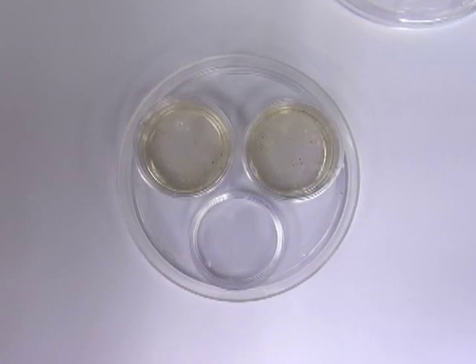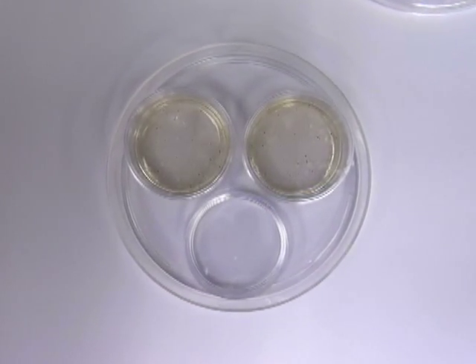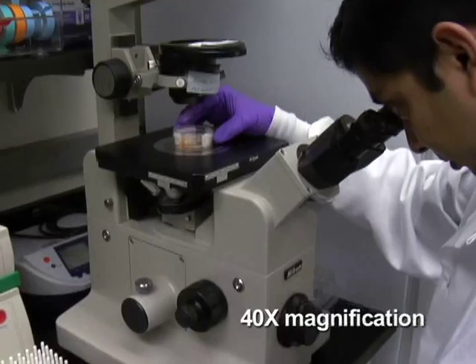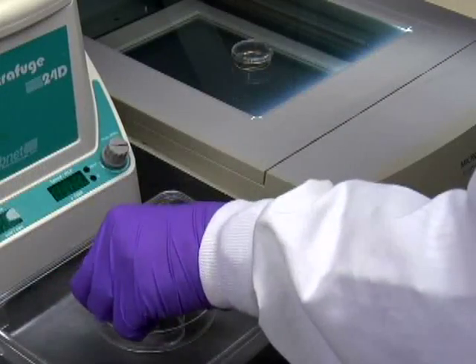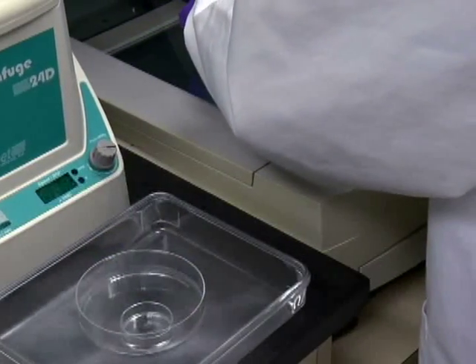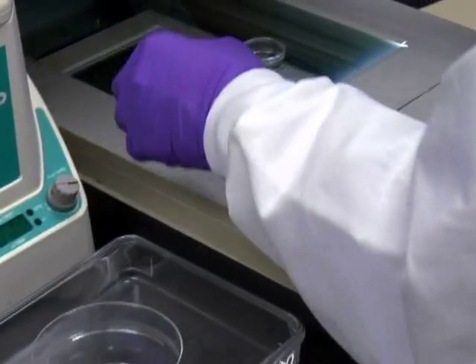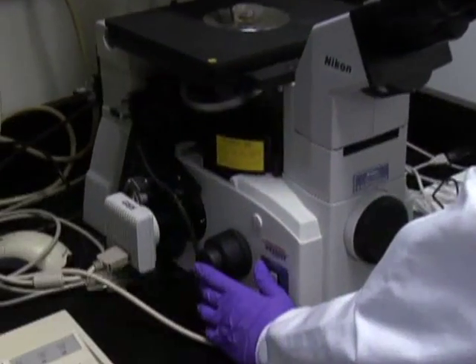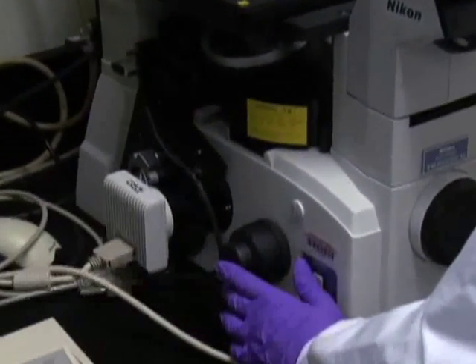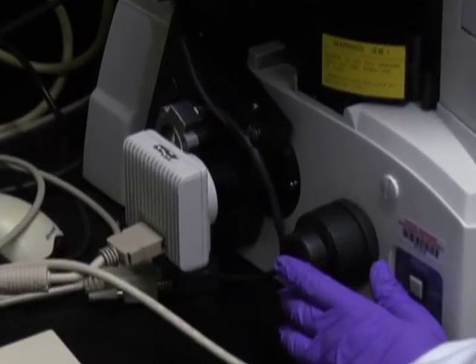Characterize and score the colonies according to their morphology with an inverted microscope at 40x magnification in a culture dish marked with a scoring grid. In order to document the culture results, scan the entire CFC assay plate using a regular scanner at 600 dpi and take low-power photomicrographs of representative colonies using an inverted microscope equipped with a color camera.